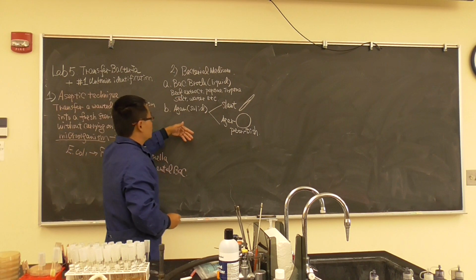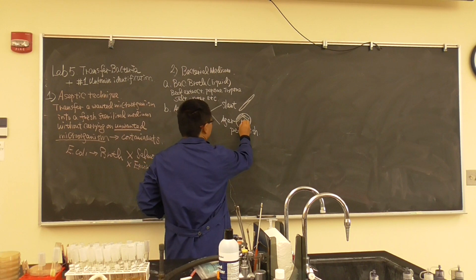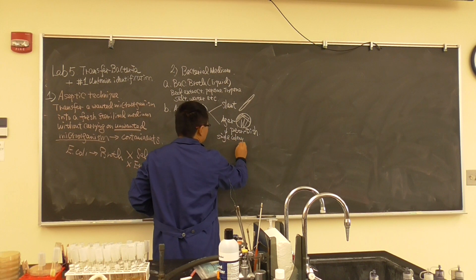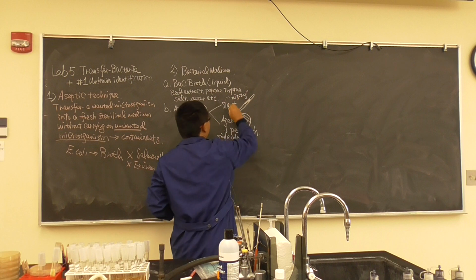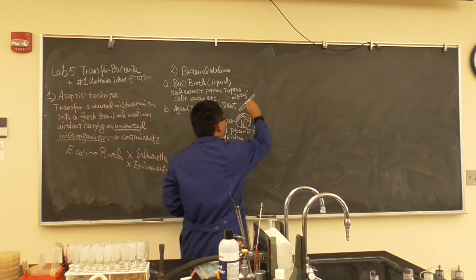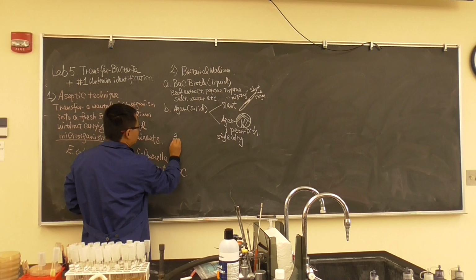Okay. So here is the thing we want to talk about. Why do we use this agar? We would love to later on, using streak plating, get single colony. Now, why do we need to use this slant? With this slant, we will do a zigzag streak. We want a very short time, less than a month of storage. So we say it's short-time storage.